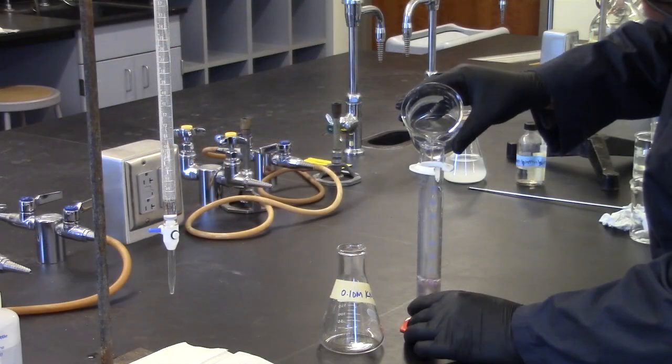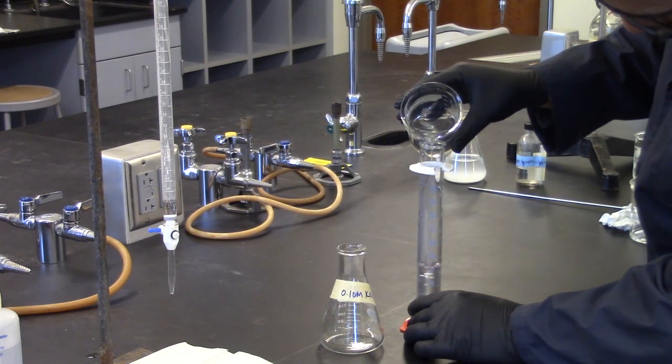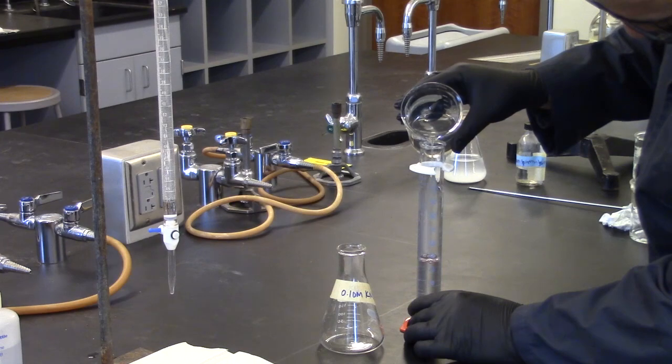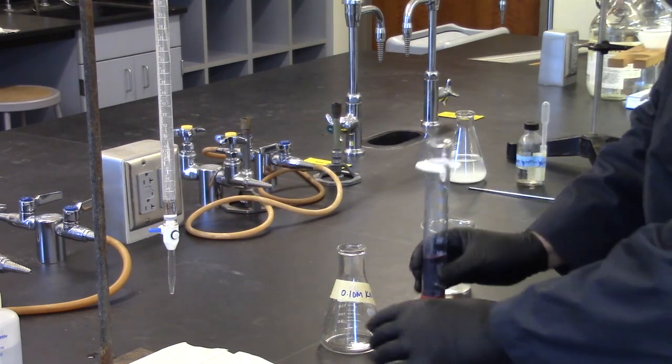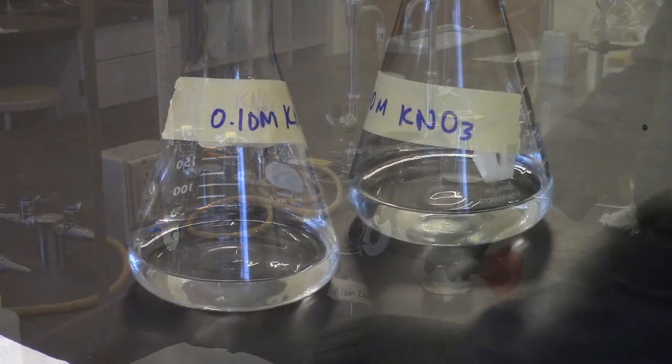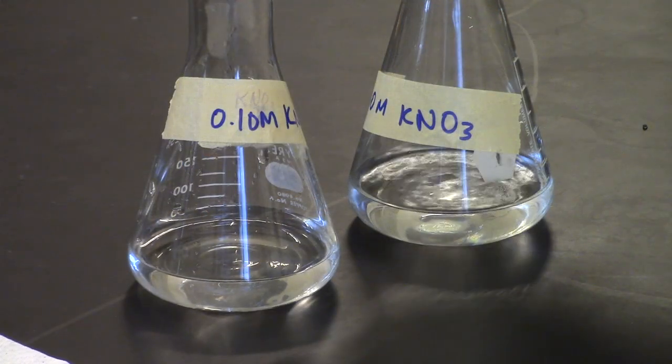Start with potassium nitrate, for it contains a common ion and it will be the least soluble. Measure out 25.0 ml samples and add two to three drops of indicator phenolphthalein to each flask.